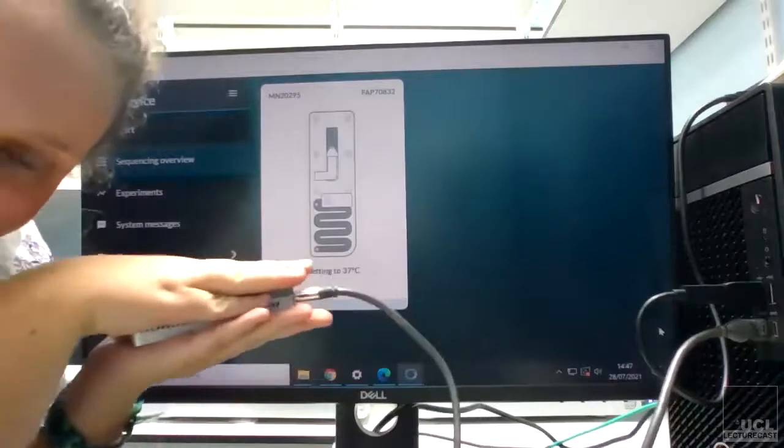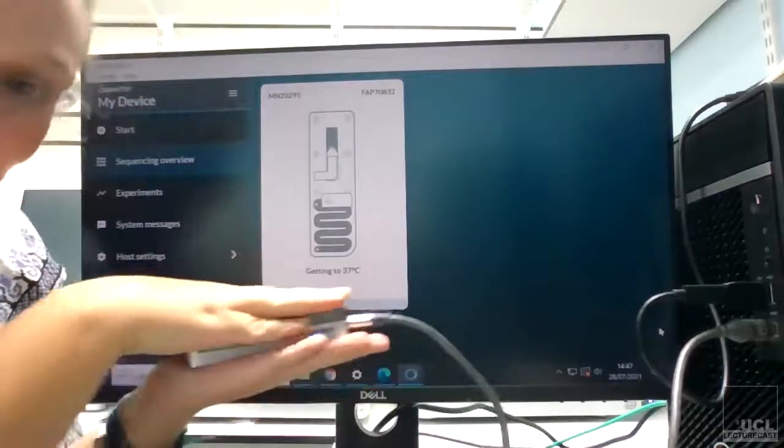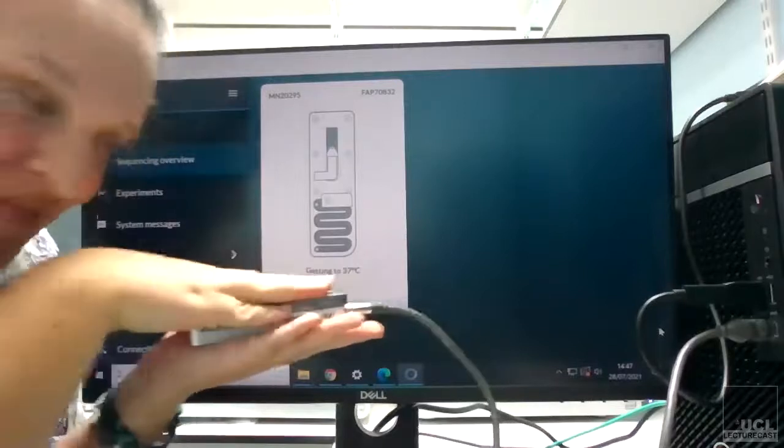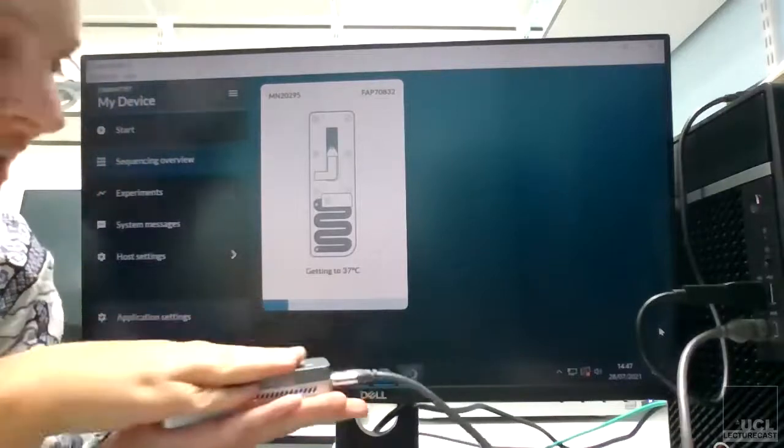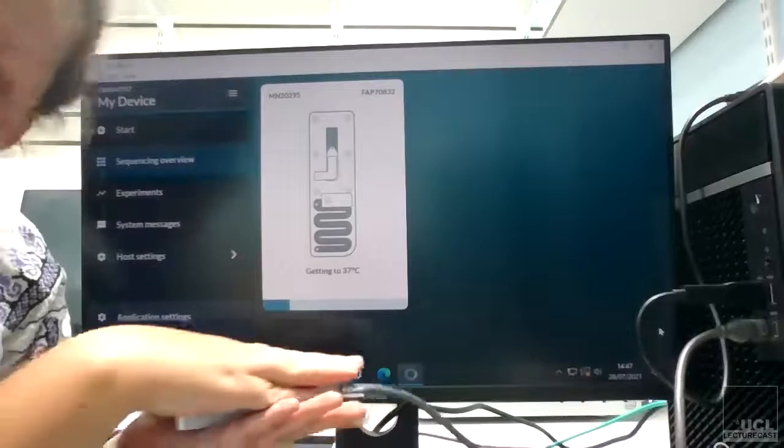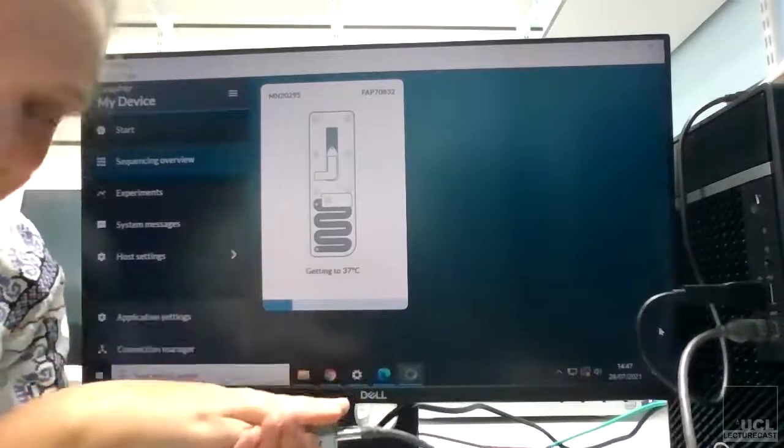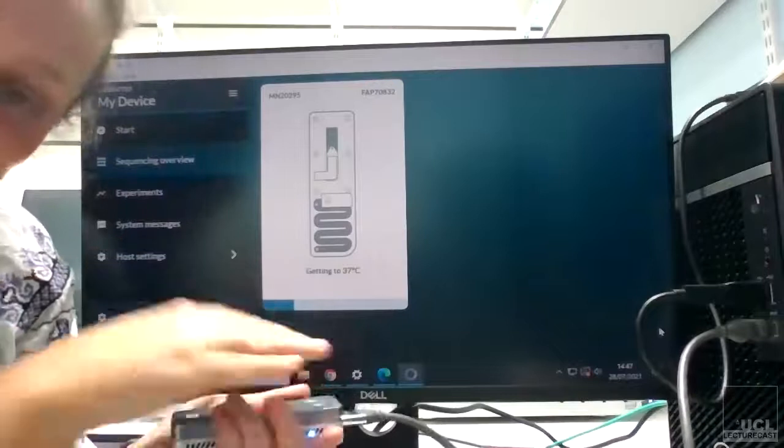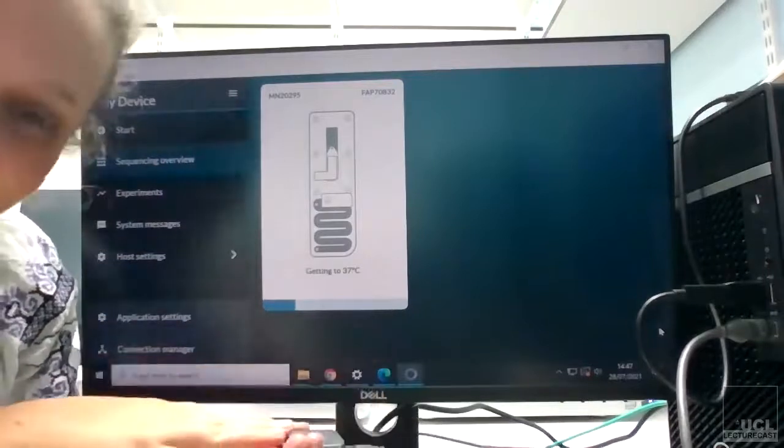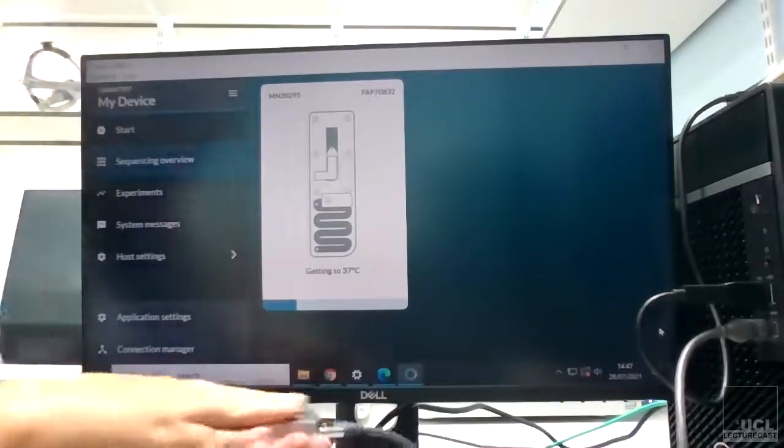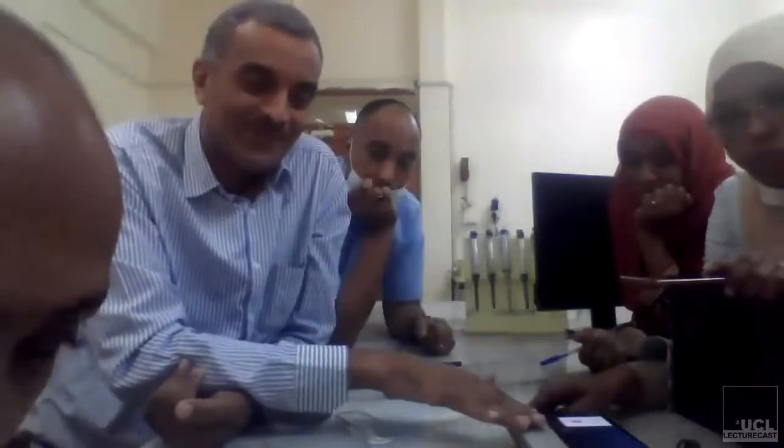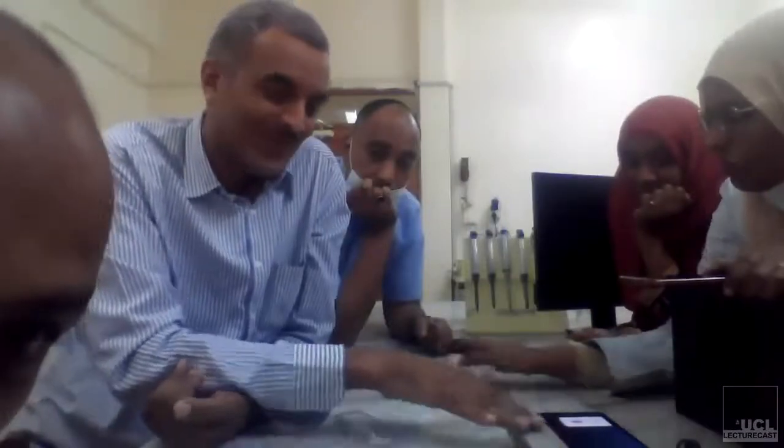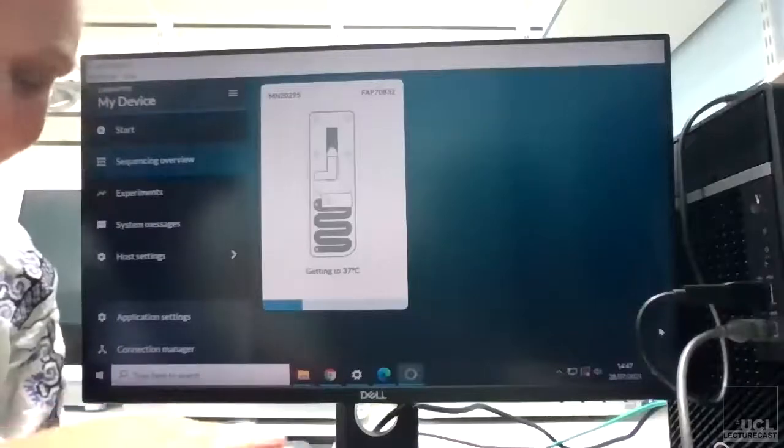So you should be able to see that there's some light. And sometimes if it's quite cold in the lab, which it is in my lab, you can give it a gentle hug and hopefully that should speed it up, because I know if it takes longer than 10 minutes to get to the temperature it needs to be at, then it fails and you kind of have to start again. Hopefully in Sudan it won't be too cold.